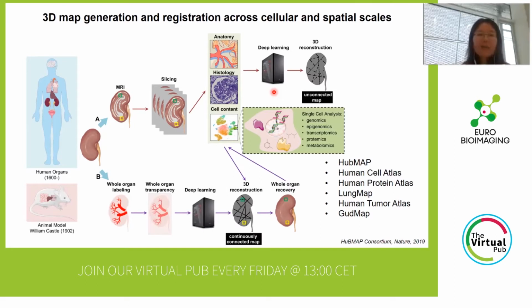So we are also interested in providing an optional way to study the whole organ map by doing whole organ labeling, whole organ clearing and imaging, and also data analysis to generate a full, continuous map. And after the organ recovery, we can still combine with other technologies for further studies.